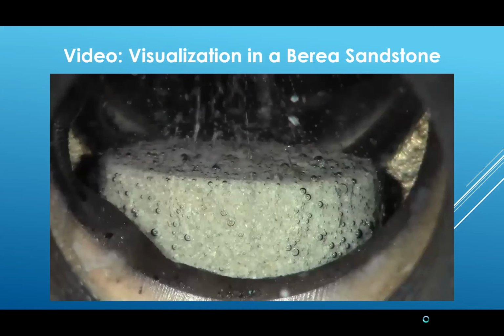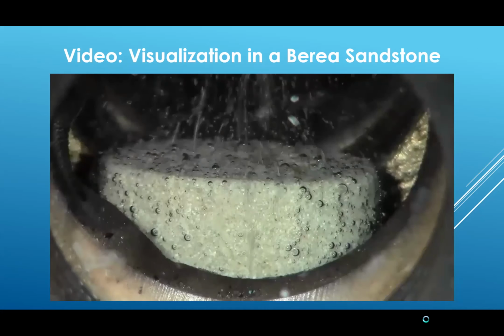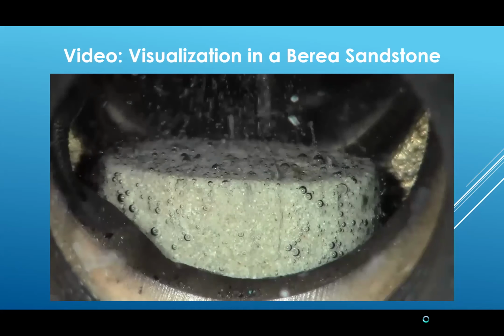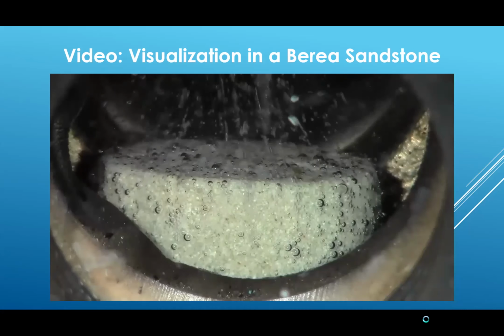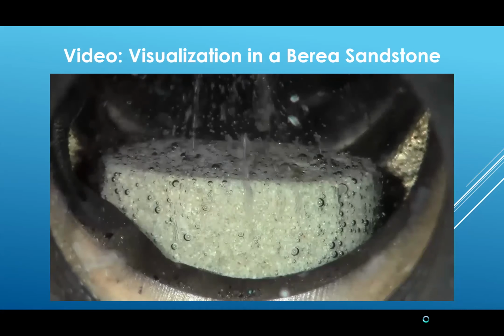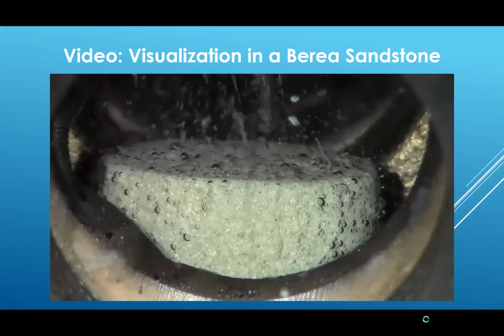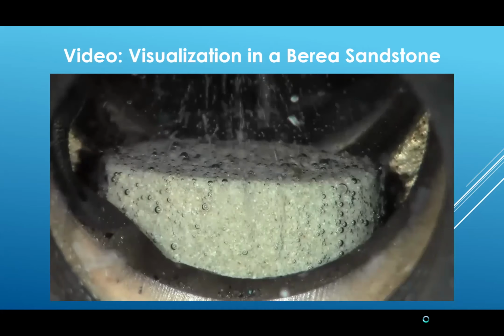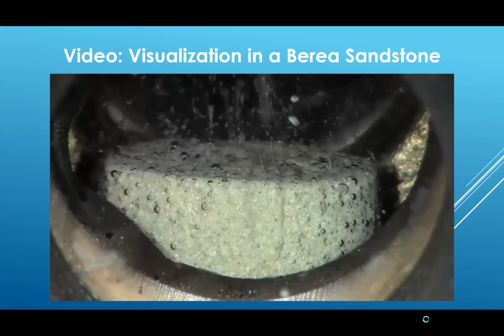This is a clip of pentane-heptane mixture vaporization in Berea sandstone under a pressure of 50 psi. According to our pore size distribution analysis, a minor percentage, meaning less than 5%, of pores in sandstone are tighter than 50 nanometers. The existence of nanopores resulted in a shifted bubble point temperature. The experiments were done to study the phase change behavior of hydrocarbon mixtures in various reservoir rocks under high pressures.